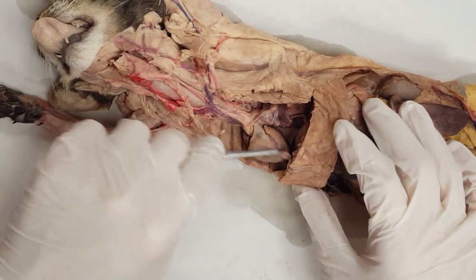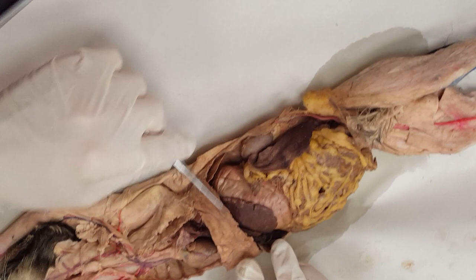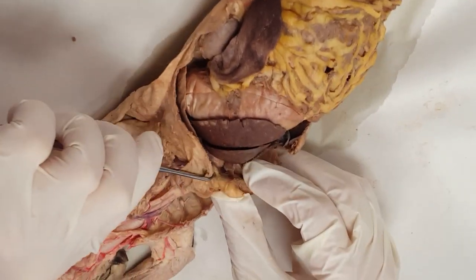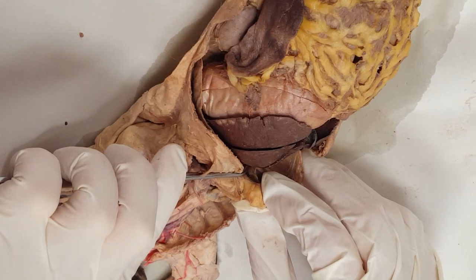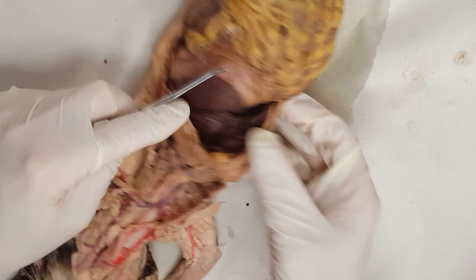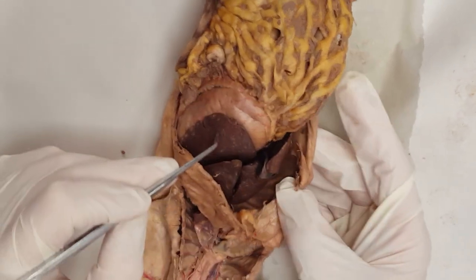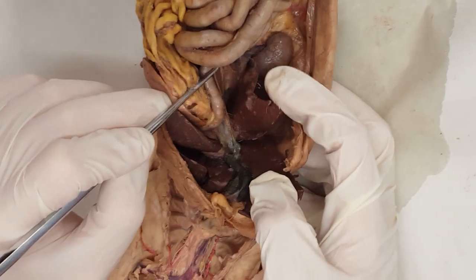Lung tissue is here. Here's your diaphragm. I'm going to lift this diaphragm up — that's the falciform ligament, holding the liver up to the diaphragm. Then you've got your liver, and it's going to have lobes. I go in quadrants: left and right medial, left and right lateral. Caudal means footward, so the caudate lobe would be pointing footward.